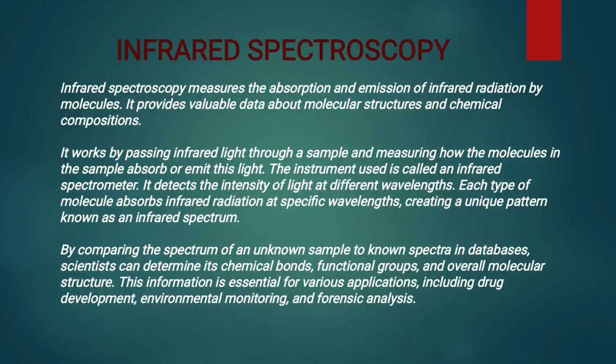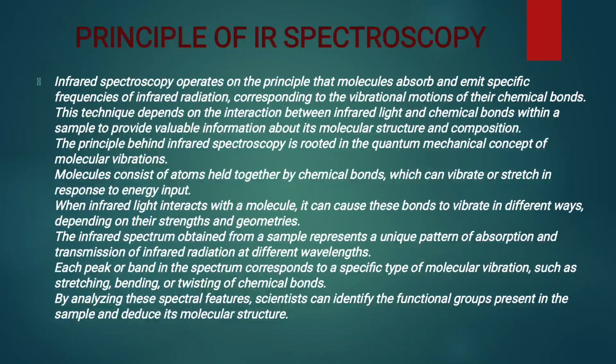By comparing the spectrum of an unknown sample to known spectra in databases, scientists can determine its chemical bonds, functional groups, and overall molecular structure. This information is essential for various applications including drug development, environmental monitoring, and forensic analysis.